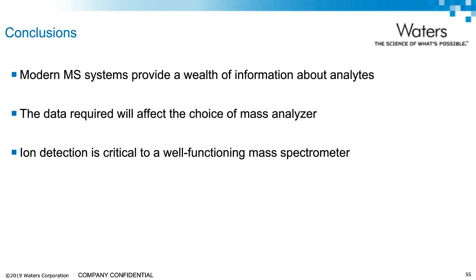So, in conclusion, there are a number of common mass analyzers available today, which will provide a wealth of knowledge about your sample. The type of data you need will, of course, influence your choice of mass analyzer, and the detector in your MS system will be critical to the recording of your data.